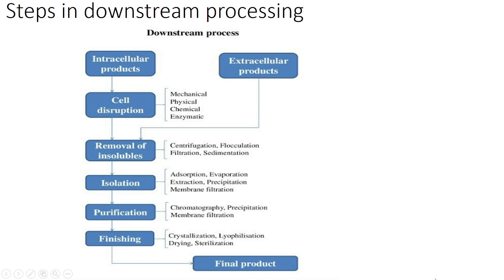You can see that many processes like filtration can come in removal of insolubles, in concentration, and in purification. So each technique is not just under one process. You can use it for a multitude of processes.